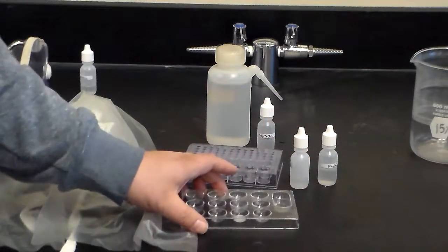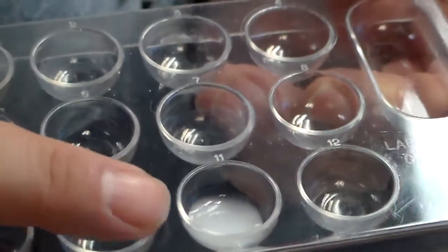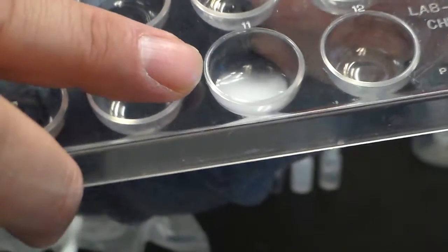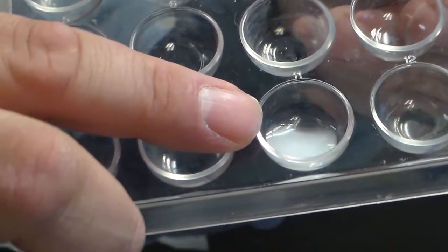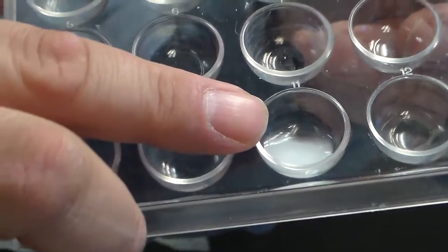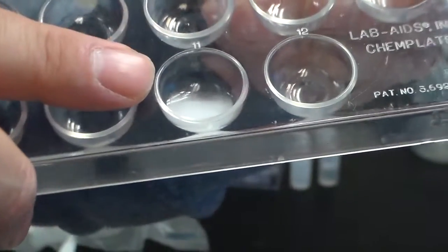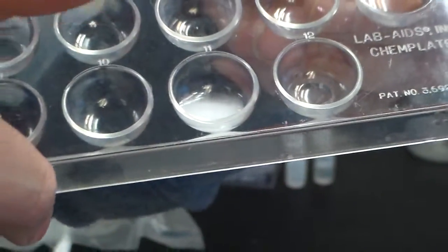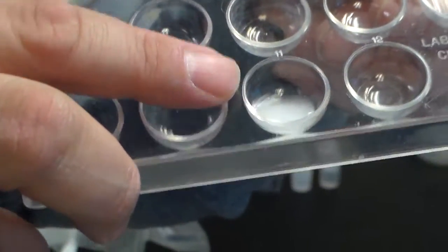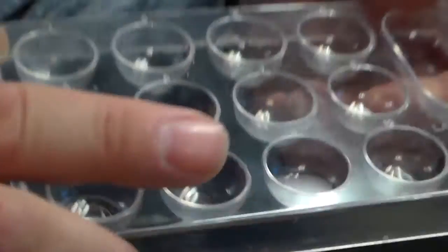That's a beautiful one. So, what does a positive result look like? Here you go. Say, wait, this is it? Wait, what do you mean this is it? What happened? I had 2 clear liquids to start with. I combined them, and this is a chemical change. We have a precipitate that has formed. This is it. So you would be writing on your data sheet that it's a positive change, and it's white, cloudy, milky, if you will, but that's a positive change. A precipitate has formed. There's a solid that is formed here.